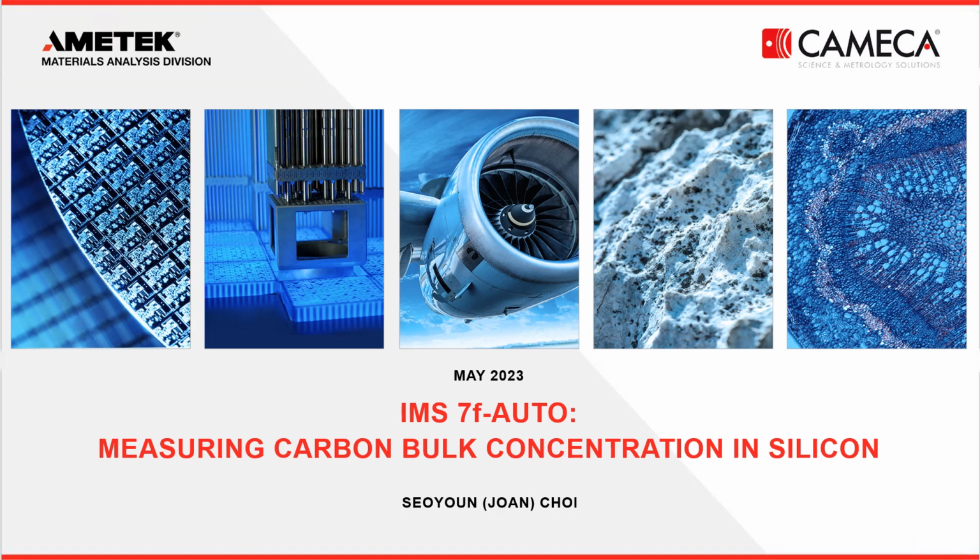What I'm going to talk about today is the detection limit analysis of light elements using the 7F Auto instrument, especially carbon in silicon case.